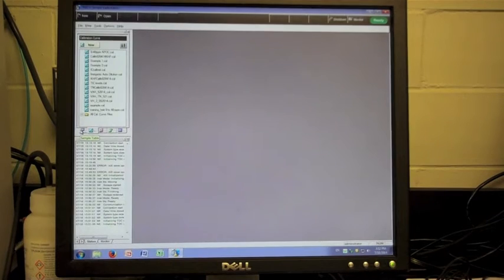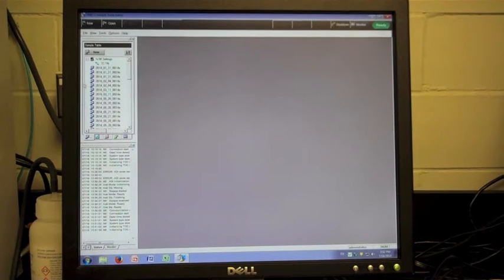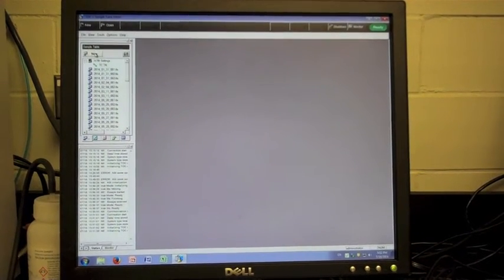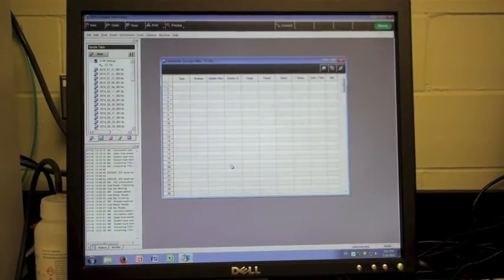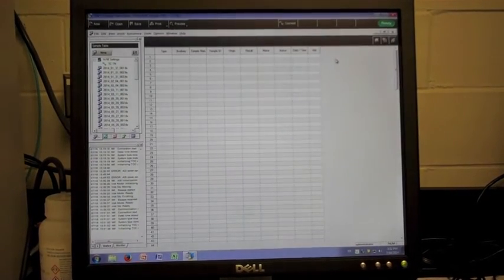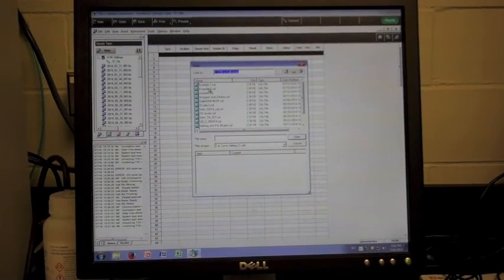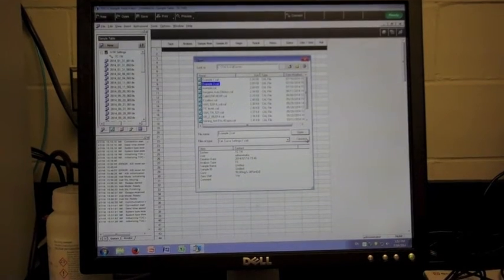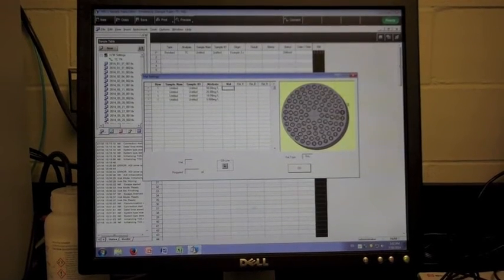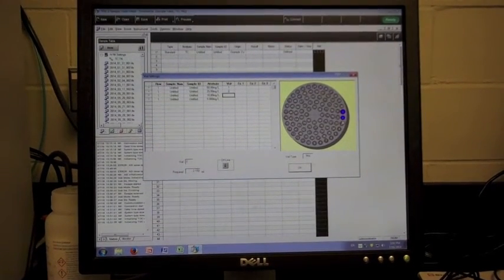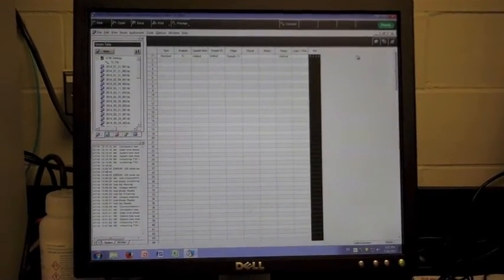Now one must run the calibrations set up to acquire the points necessary for a calibration curve. Go to the left side of the window and select the sample table option. Continue through the first window and a table will appear. Select a row, then select insert from the toolbar at the top, select the calibration option, and select the calibration file you created. This will place your designated calibration points into the sample table. For the multiple known standard calibration, assign each vial of the standard its own vial number corresponding to its location in the machine.